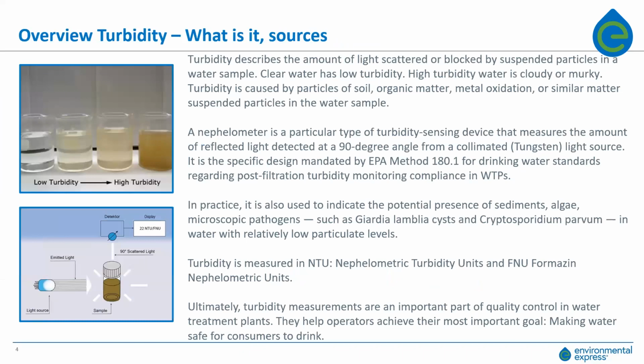So first, let's dive into turbidity, what it is, some of the best practices, the treatment process for a typical water treatment plant. I wanted to give everyone a better understanding of that process and explain where the different instruments or test methods are used.